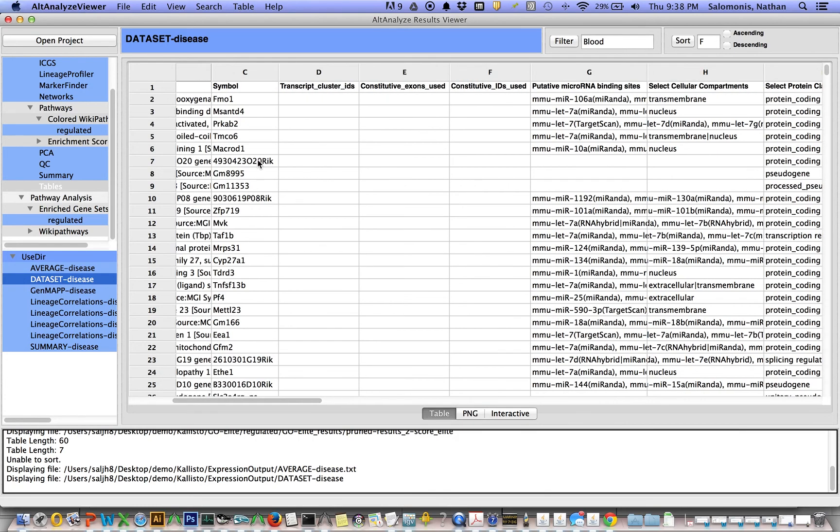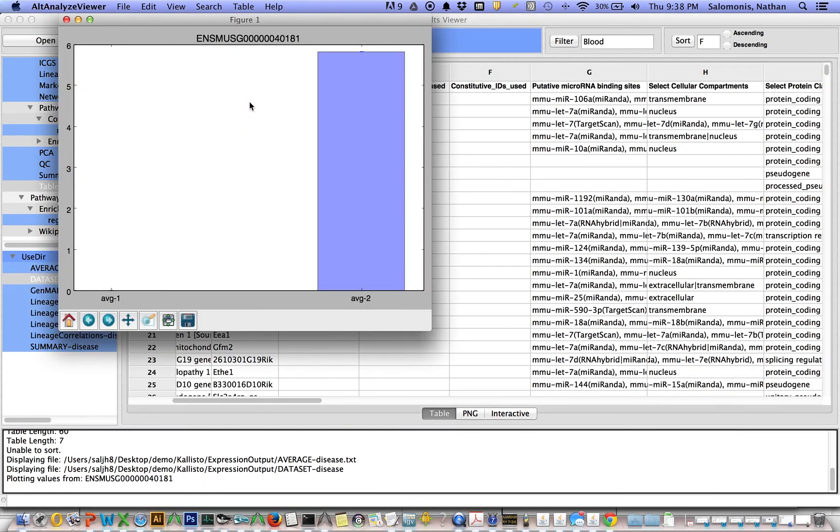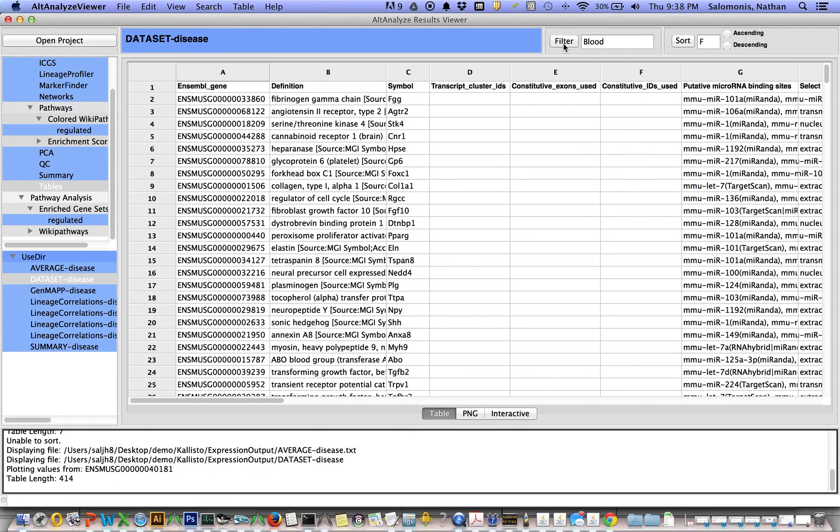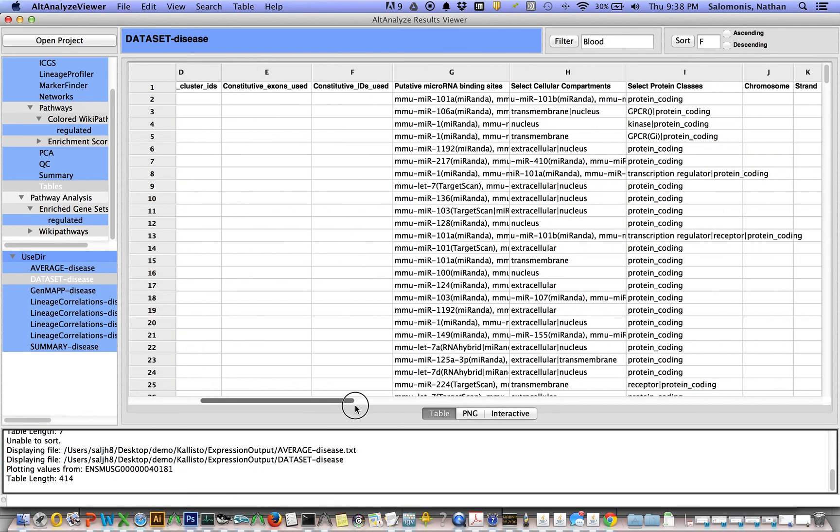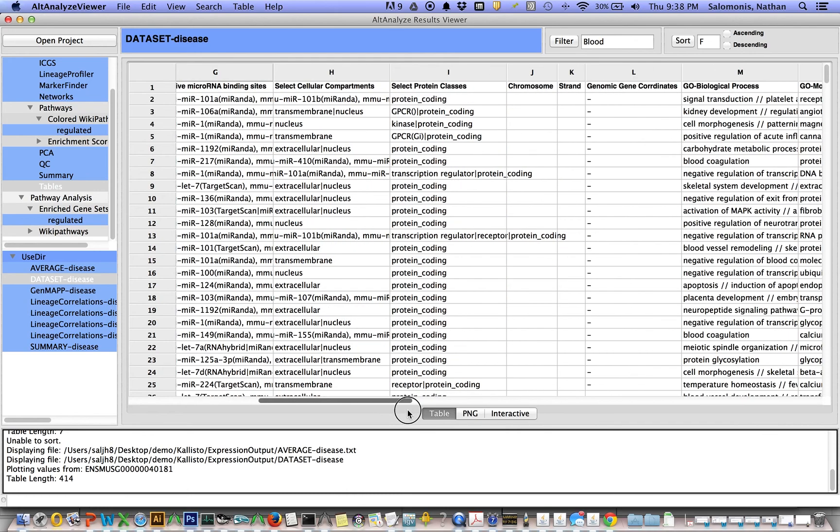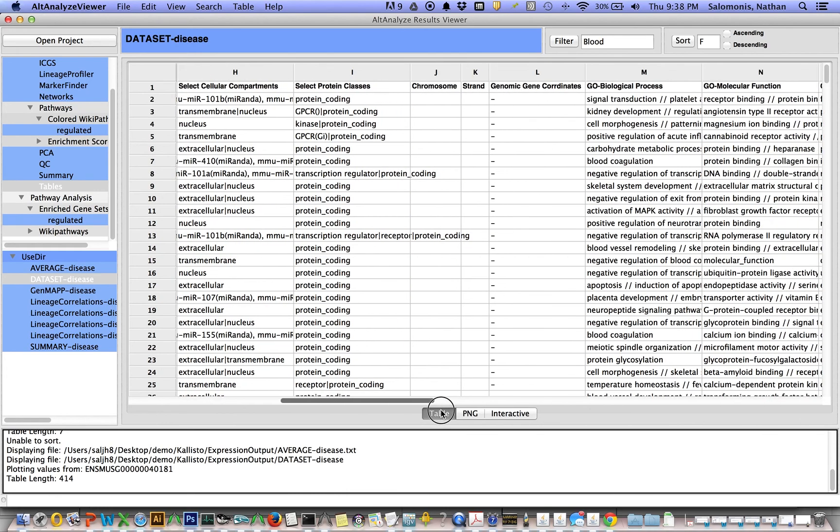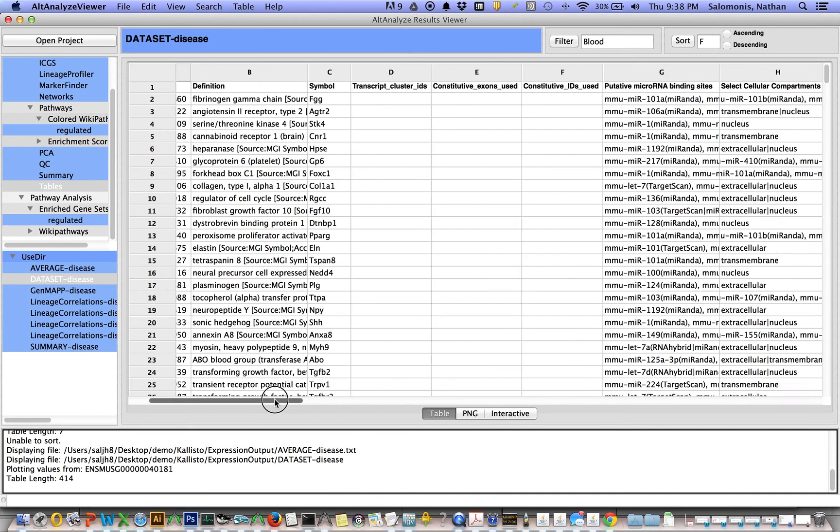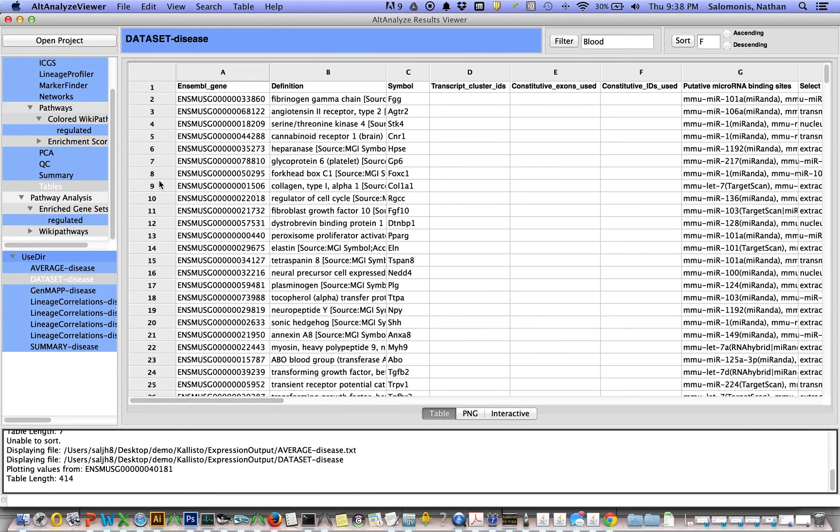You can actually select these genes and view the results in terms of a plot here. This gene was not expressed on average in group one. It was highly expressed in group two. Again, you can actually do some filtering here. You can filter again for blood and we'll get all results, all rows effectively, that have any mention of blood in them. So that's a pretty nifty option there.